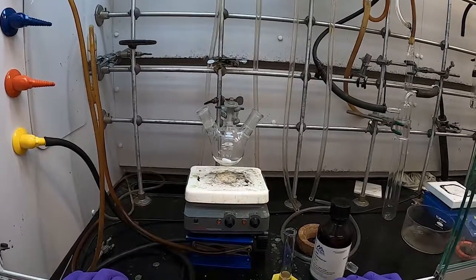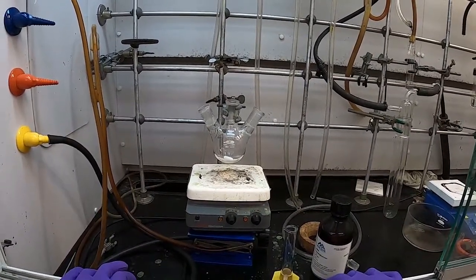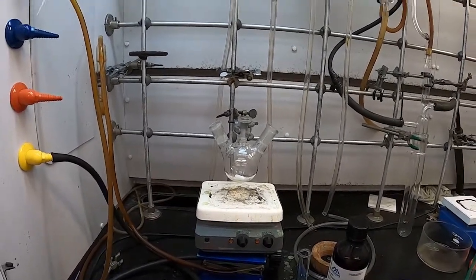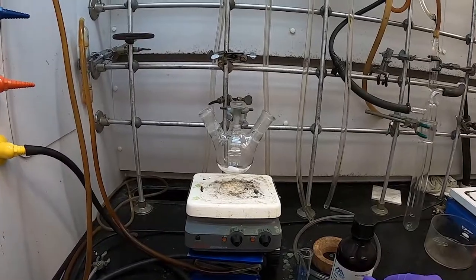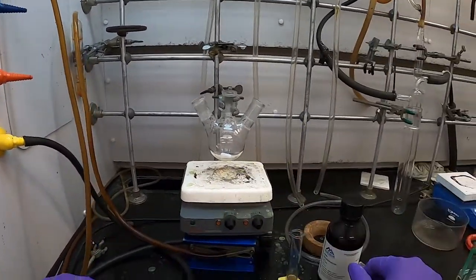Welcome to Chemistry 410. This is the thermal decomposition of tert-butyl ammonia borane. So to begin, we need to assemble our apparatus here. I've got a 250 milliliter 3-neck flask here clamped up. It already has a stir bar in it.